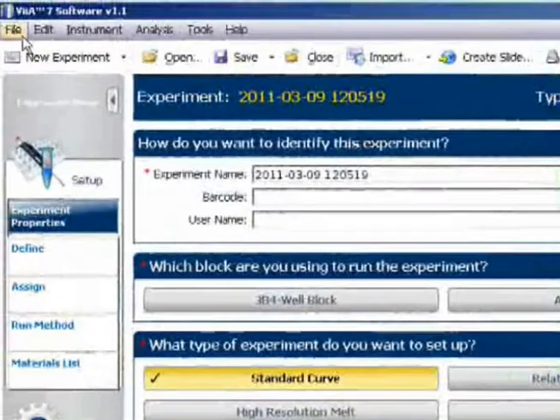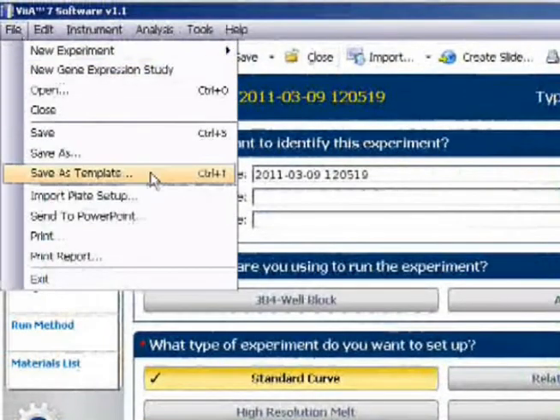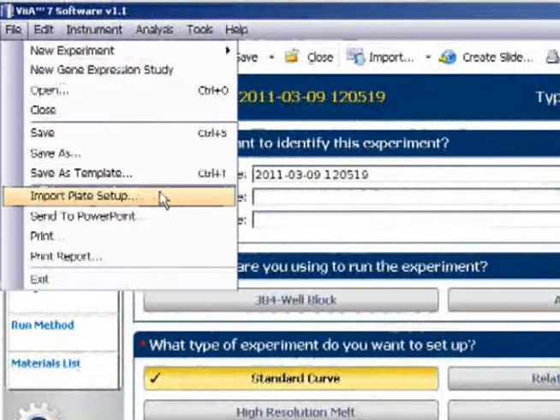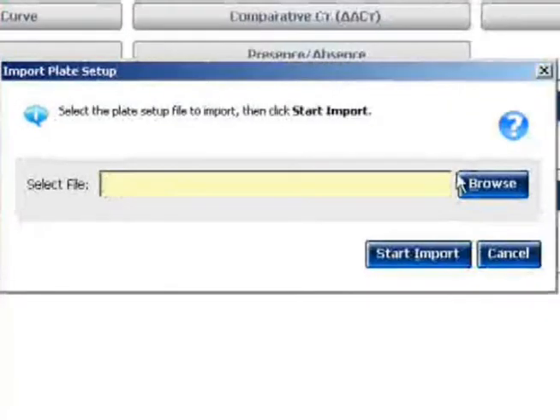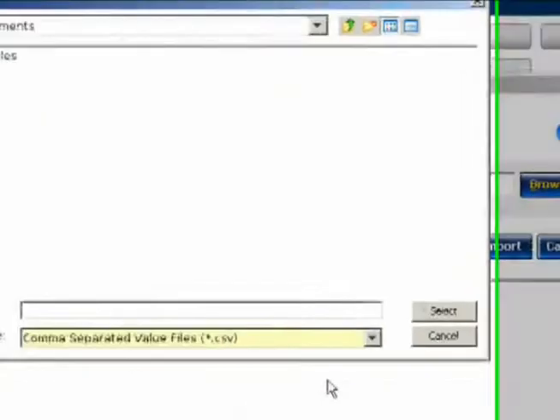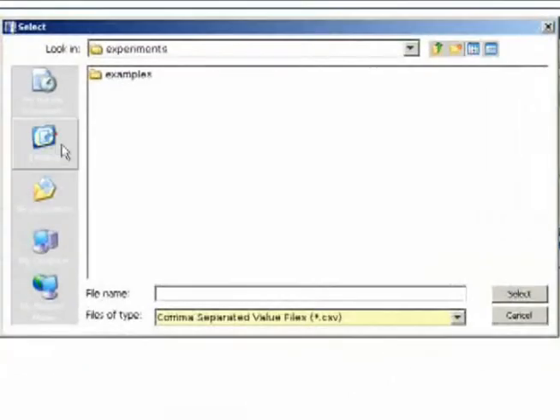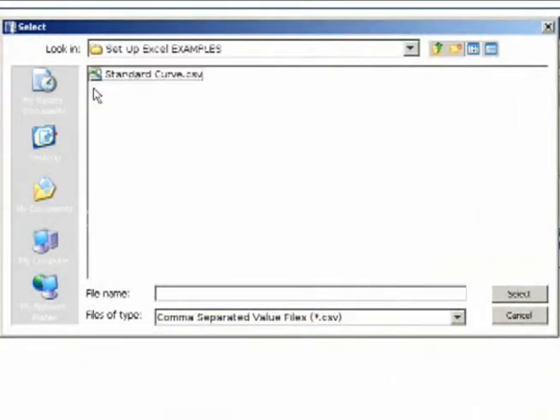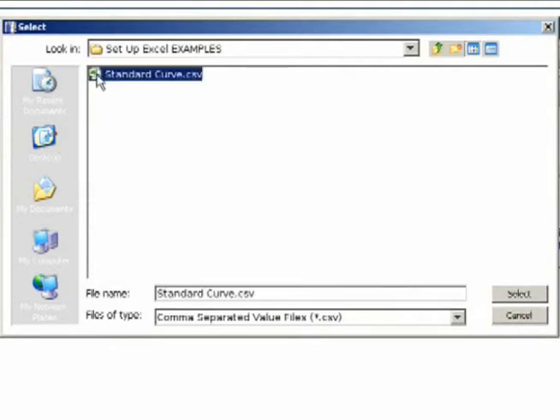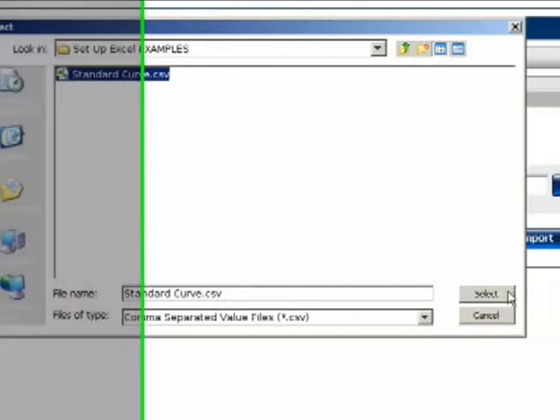And click File, Import Plate Setup. I browse to the location where I saved the file, and there it is. I highlight the file name and click Select.